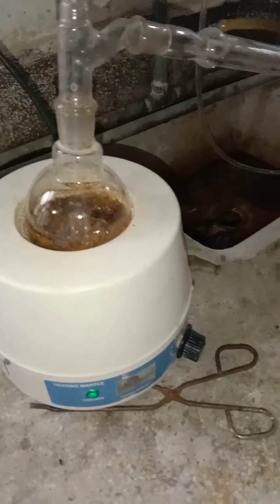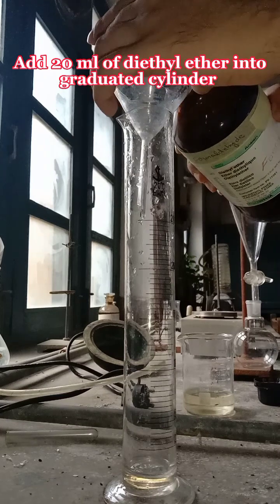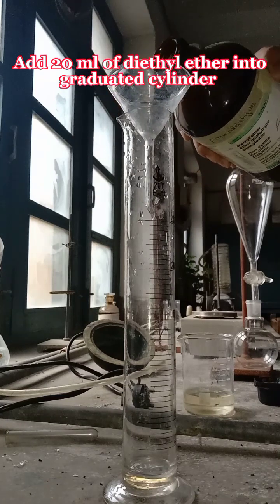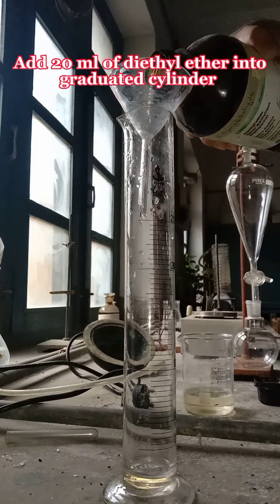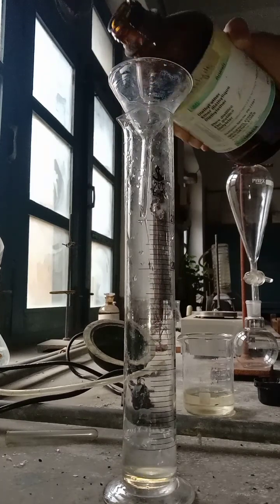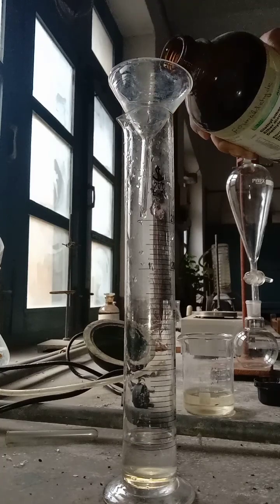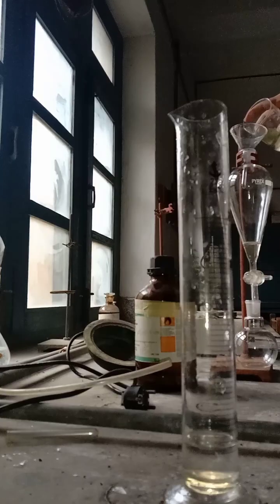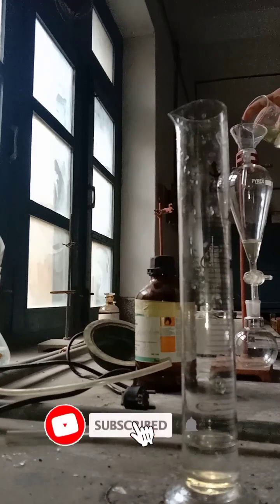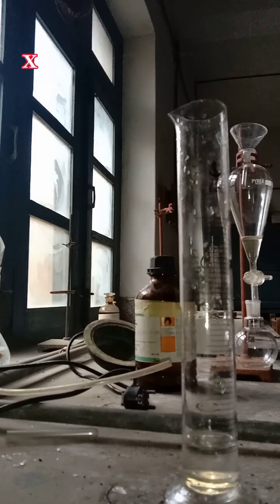Now the distillation has started. We take 20 ml of diethyl ether into a graduated cylinder, and then take the filtrate and put it into a separating flask.